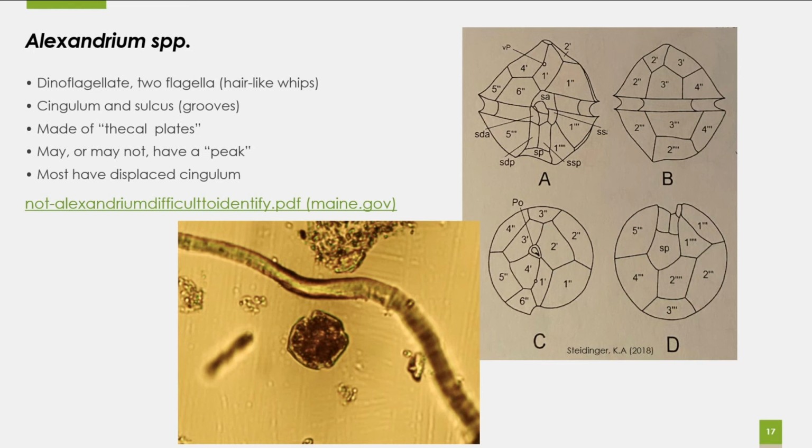It has happened where it's expanded almost a little bit, and the cell itself is still smaller within that. And last year, I think, we saw a few that looked very similar to the Scrippsiella but didn't have that point, and we were like, this could be Alexandrium, we're not really sure. But it did have that kind of sheath, which wasn't something I normally saw with Alexandrium, so I wasn't sure, and we kind of just marked it as uncertainty.